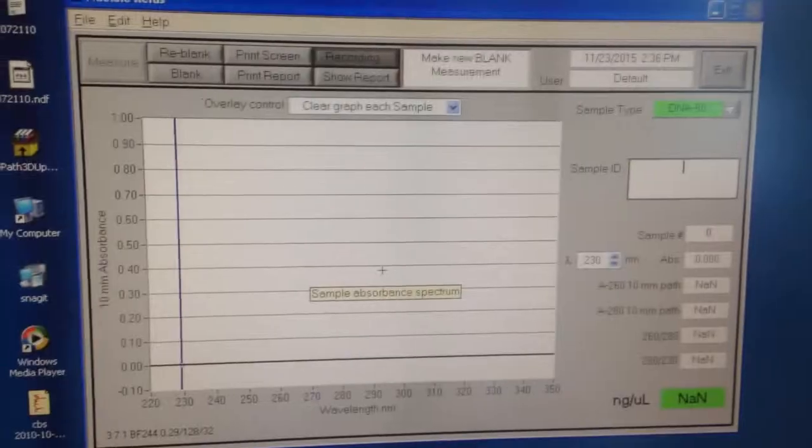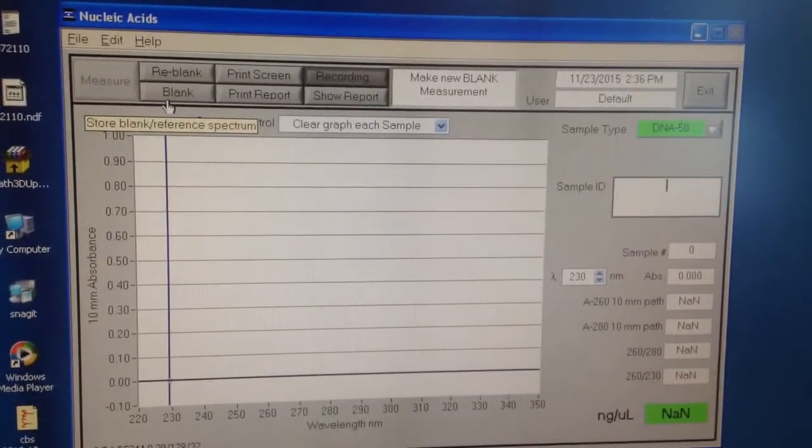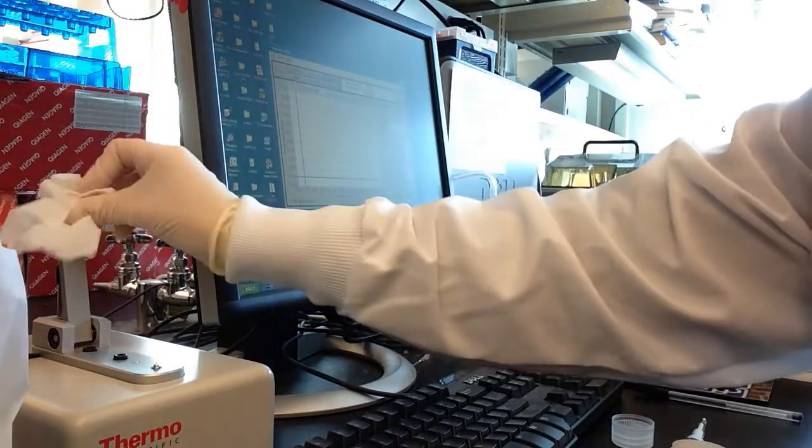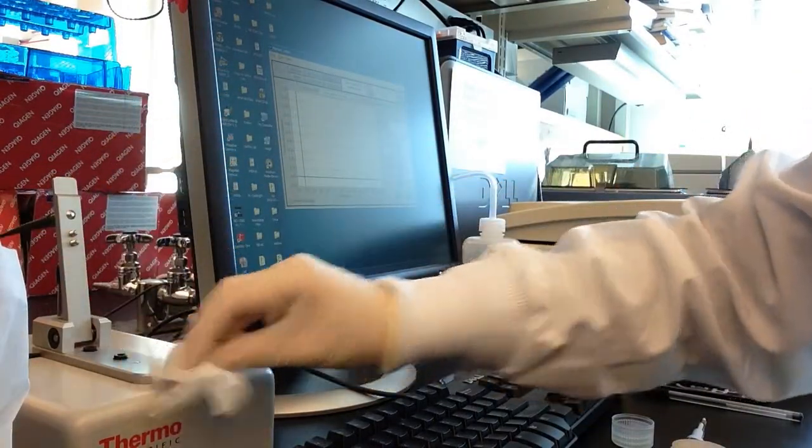Next, you'll want to blank the machine similar to the way that you blanked the big spec. You will have to wipe down the pedestals with Kimwipes again.